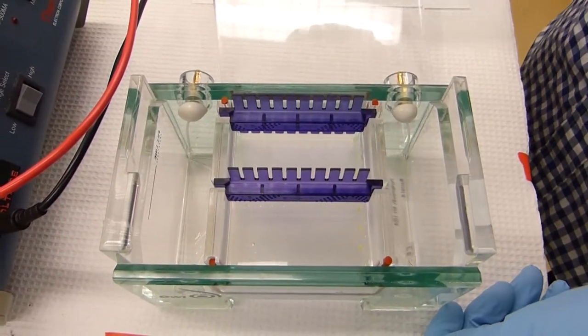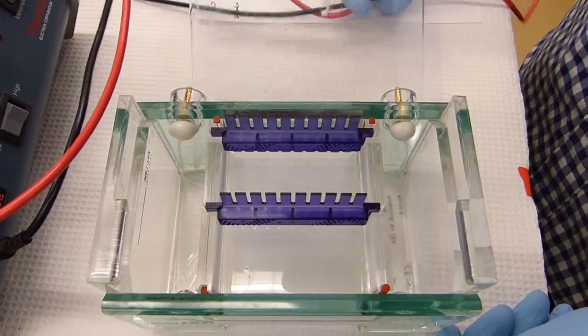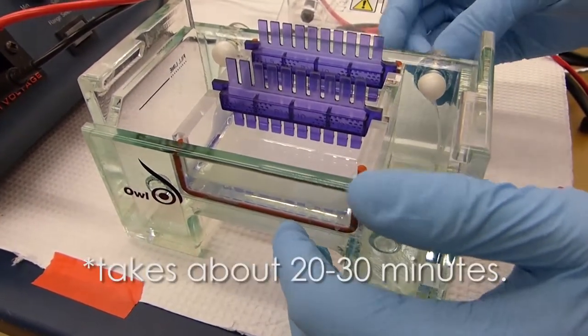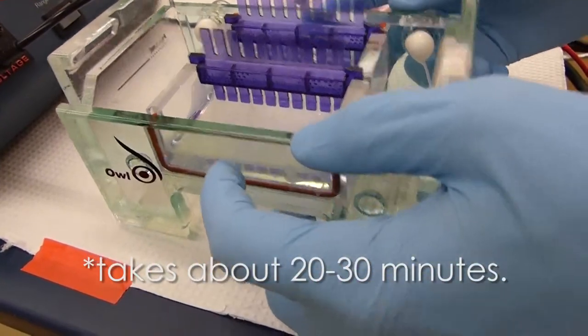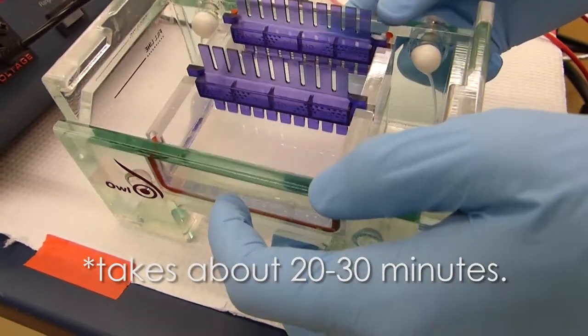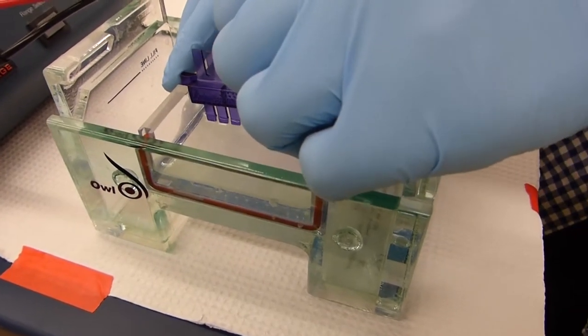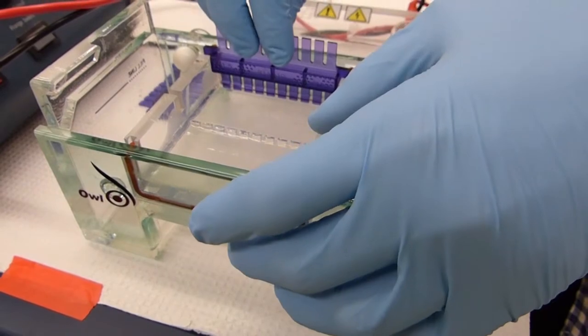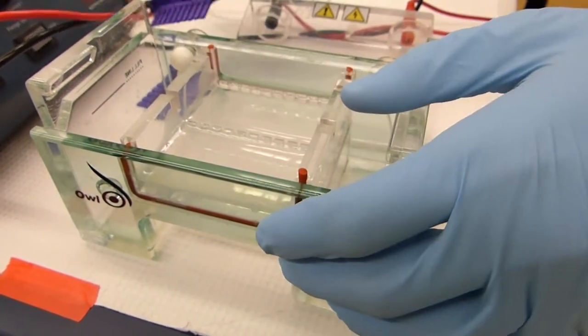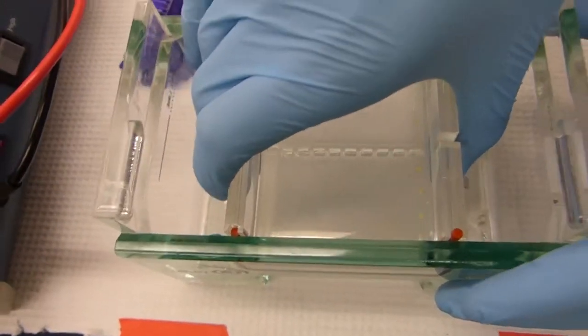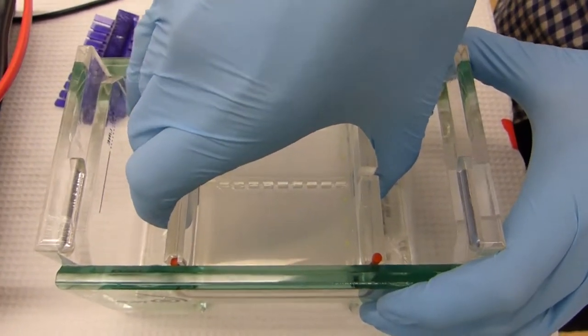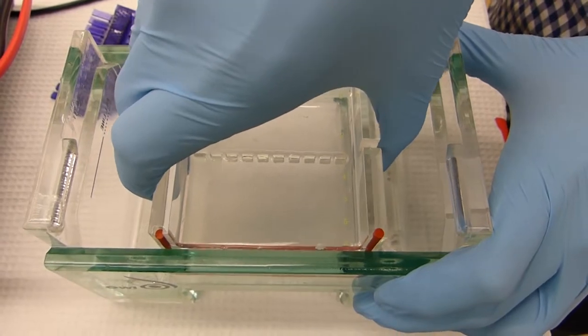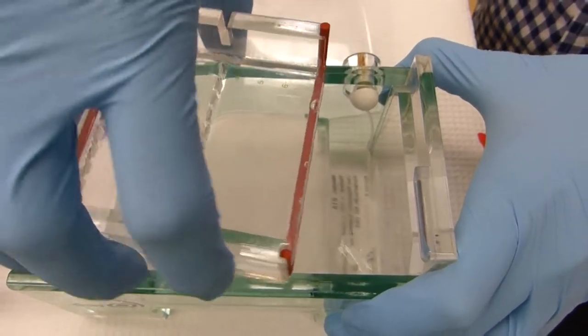After this, you let your gel harden and then you can go get your samples during this time. When the gel is done or appears to be done, to check this you can tap the sides and then tilt a little bit to make sure it doesn't move. You can slide out the combs carefully, place them to the side, and then pick up the gel and turn it.